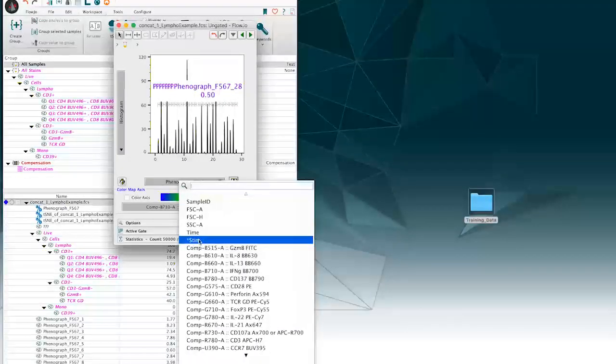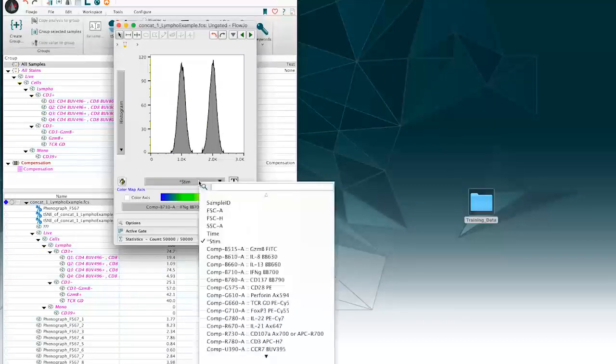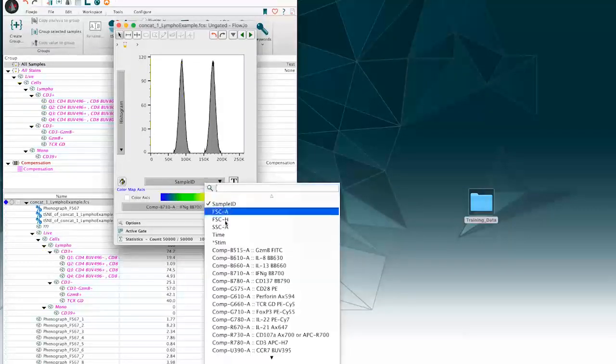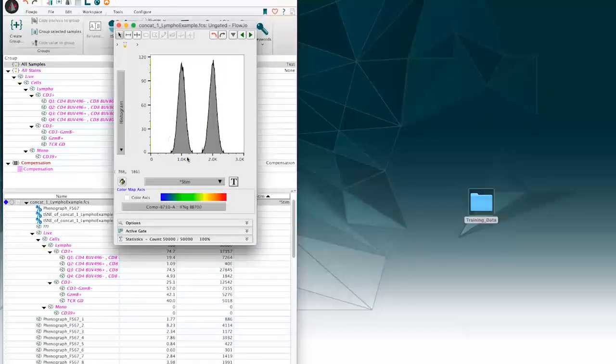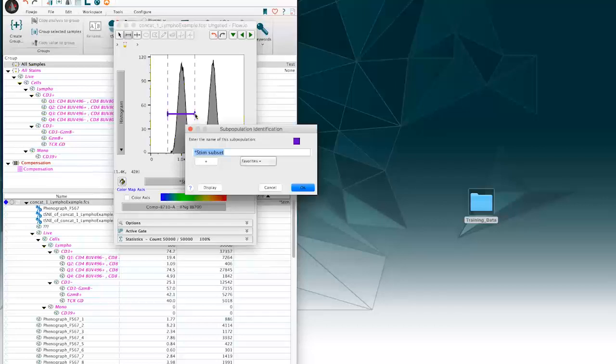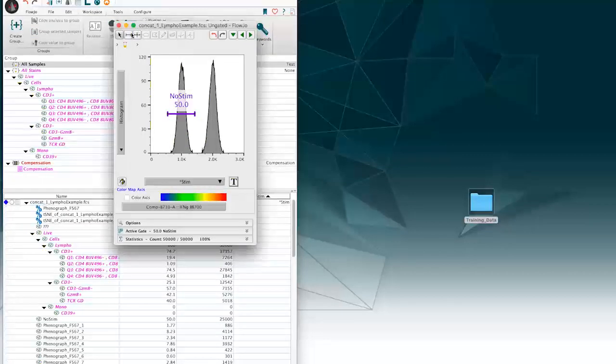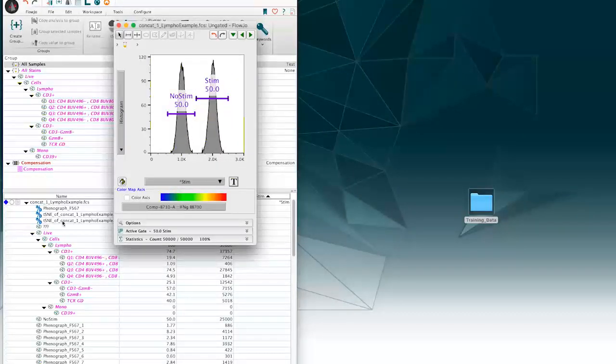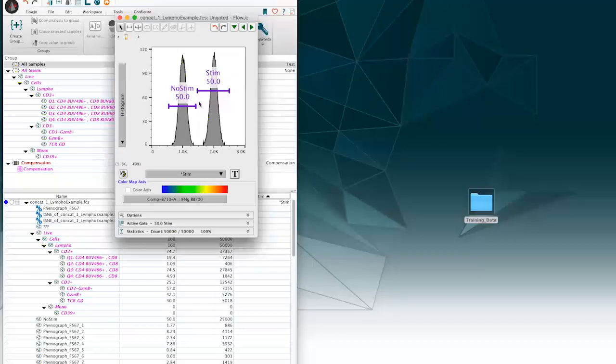My stim condition keyword, this is where I can pull apart my samples. I also always get a sample ID keyword, but sample ID is in the order of the list when you concatenate it. This stim keyword is me saying I want these events to be at 1 and these events to be at 2, so I control the placement and the order. So I'm going to call this no stim and stimulated. And just remember that every cluster has a classification here, it contains events from stim and no stim, and you can break it apart.